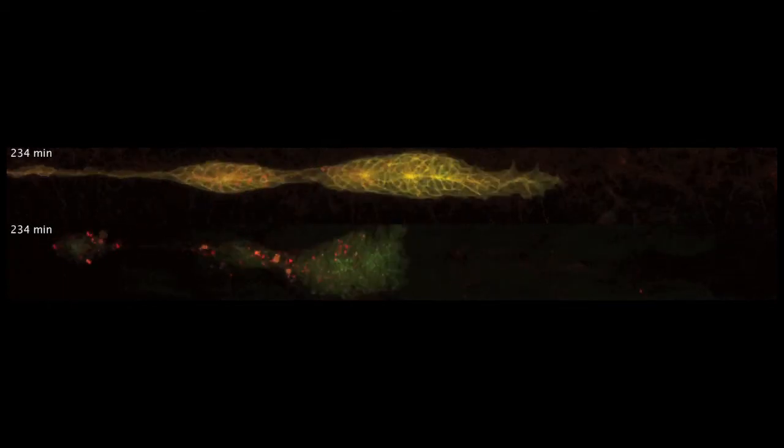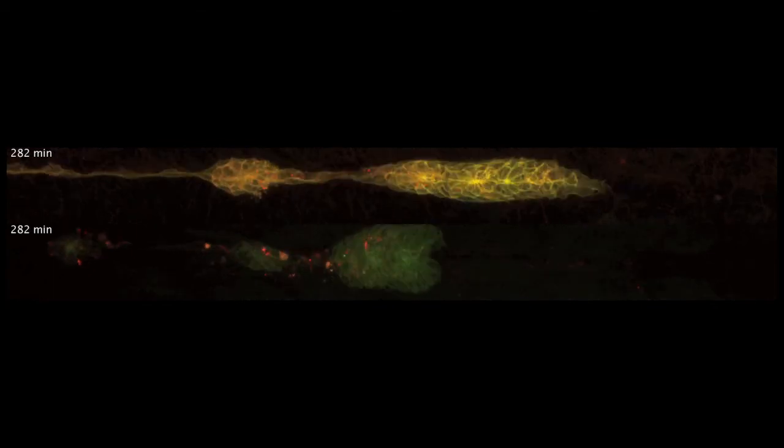What you will see in the lower sample is we will expose this tissue to an increased level of the guidance molecule, a chemokine. The receptors are rapidly removed from the cell surface upon this increased exposure to the chemokine molecule.